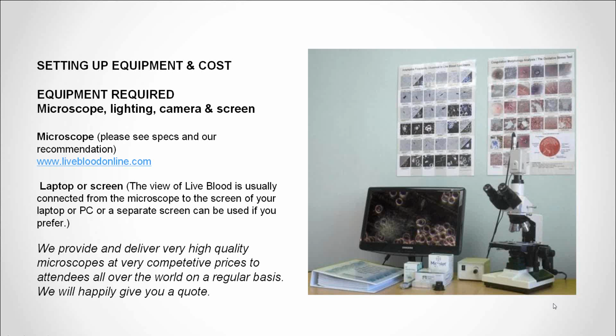If you spend time behind the microscope taking blood samples, practicing on colleagues and family and friends, going from bright field to dark field, viewing the samples and adjusting the settings on the microscopes and so on. If you do that regularly, we generally find that our students are proficient with their microscopes after about a month or 2 months maximum.